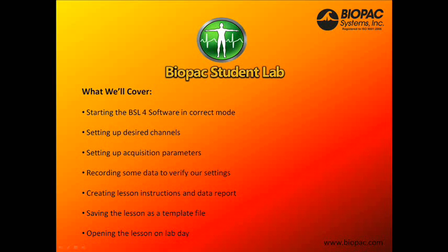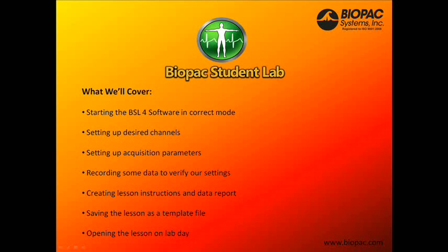In this tutorial, we'll cover how to start the BSL-4 software in the correct mode, how to set up our desired channels, how to set up our acquisition parameters, then we'll record some data to verify our settings, then we'll create lesson instructions and a data report. After that, we'll save the lesson as a template file, and I'll show you how students can open the lesson on lab day.